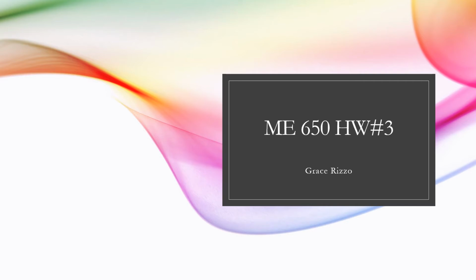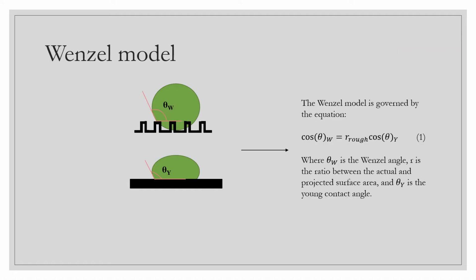In this experiment, I will explore the relationship between the surface roughness and hydrophobicity. The Wenzel model can be used to describe this relationship between surface roughness and hydrophobicity. As the liquid penetrates the rough surface, two angles form, an apparent contact angle and Young's contact angle.